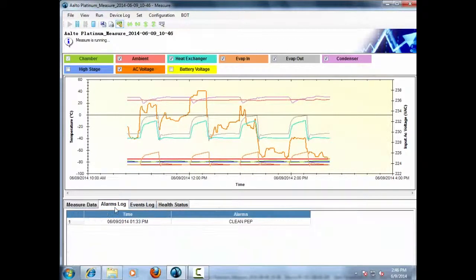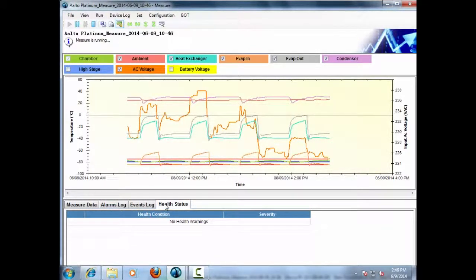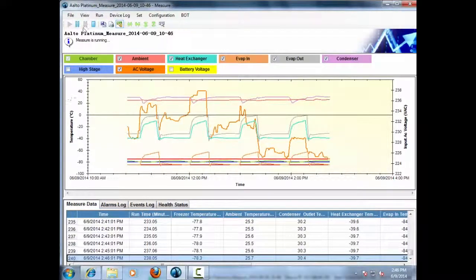Measurement data, alarm logs, event log, and health status of the ULT freezer can also be seen on this screen.